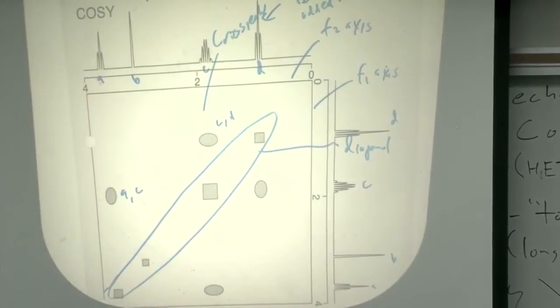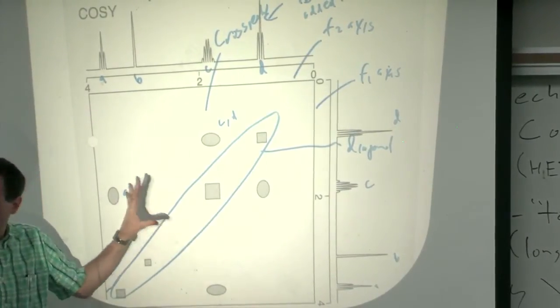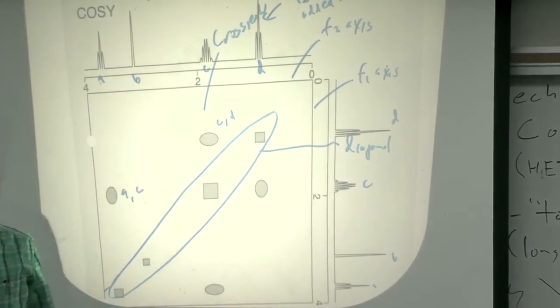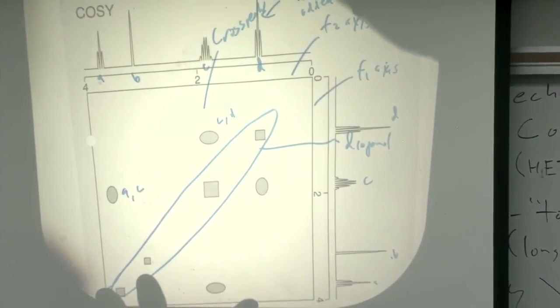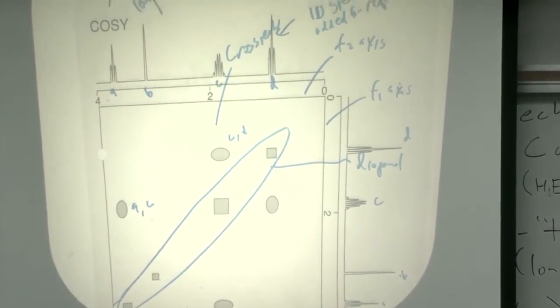And I like to go ahead and basically keep the idea of my peaks and my cross peaks before we assign where those peaks are in the molecule. So of course now we know that in this molecule, this is HB, this is HA, this is HC, and this is HD.